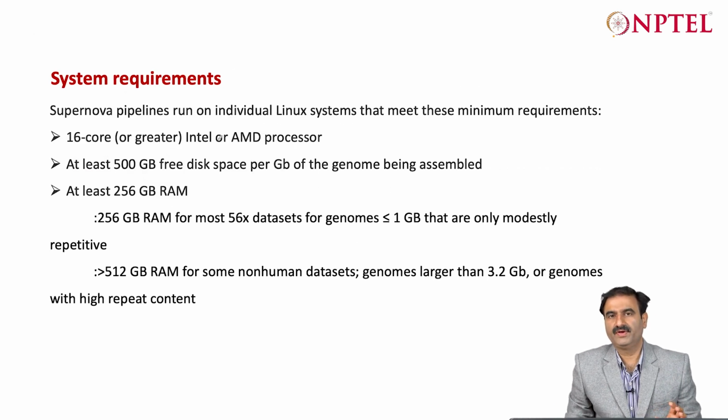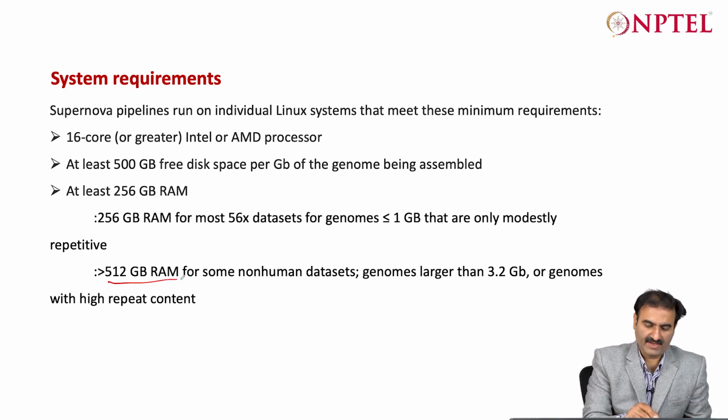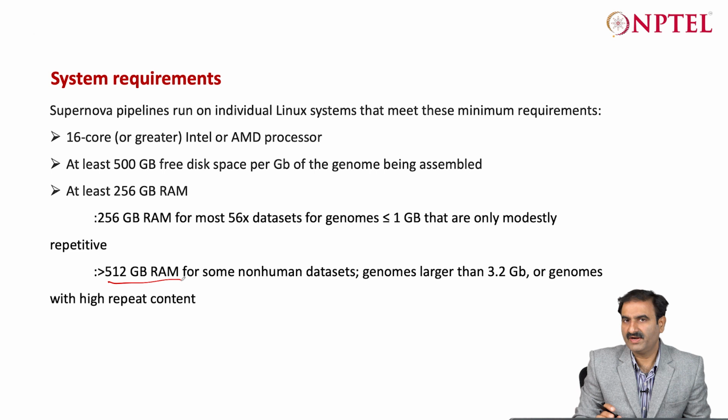Because it is basically keeping so much data in memory, it requires a large amount of RAM, about 500 GB, and basically this is one of the most RAM intensive genomics software that you will come across for the genome assembly part, right.